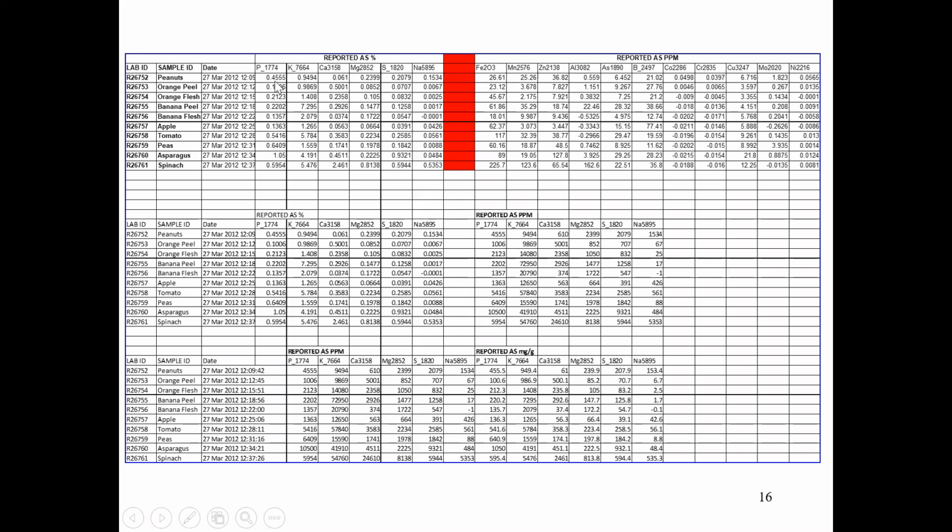Those are in the vacuum. So for those non-metals, you have to create a vacuum, and you can do that with the kind of instrument that they have. Does that make sense? So for AA, if you have to analyze these non-metals, you have to operate in a vacuum, which is sometimes difficult to do.